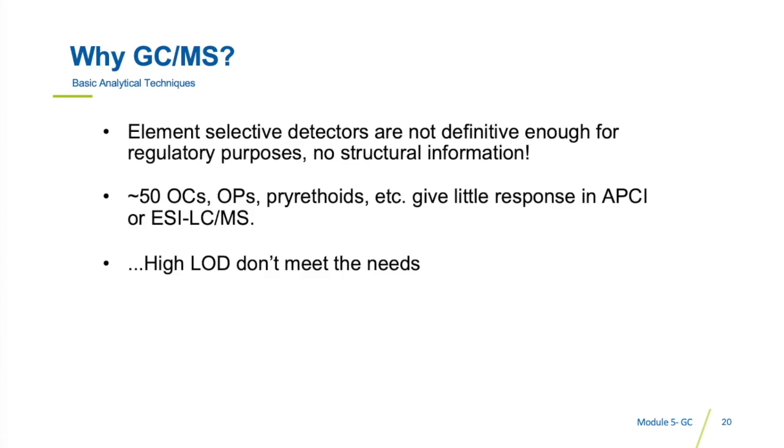This has contributed to make GC highly desirable again in the food safety laboratory, especially for pesticide residue analysis. When the scope of the laboratory more broadly covers food analysis, the strength of GC for oil analysis and its powerful detection and confirmation of pesticide residues give it even more value for a lower cost than the liquid chromatography equivalent.